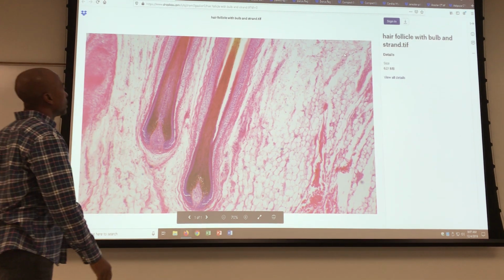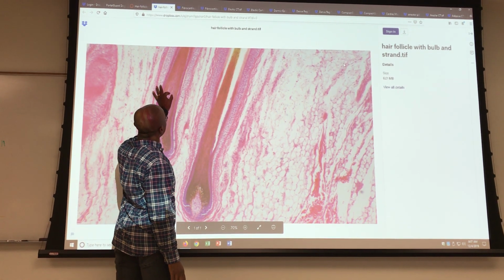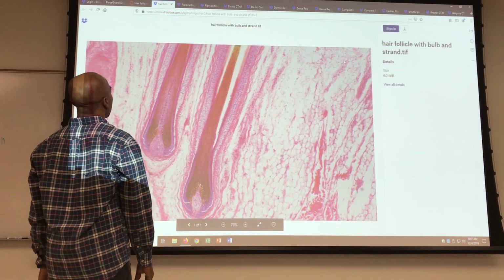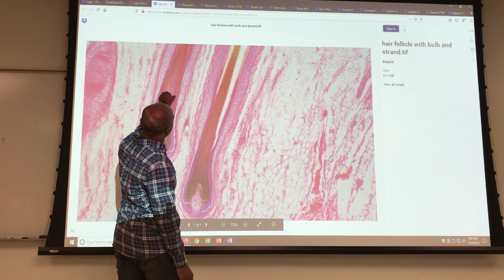Cortex? The medulla is in the very center. Right around here on the edge of it is cortex. Down in the middle of the thing is the medulla. Is it the cuticle? Cuticle is at the very edge. That was hard to tell on this one, actually. A bit more on the edge out here. That little white thing, cuticle.